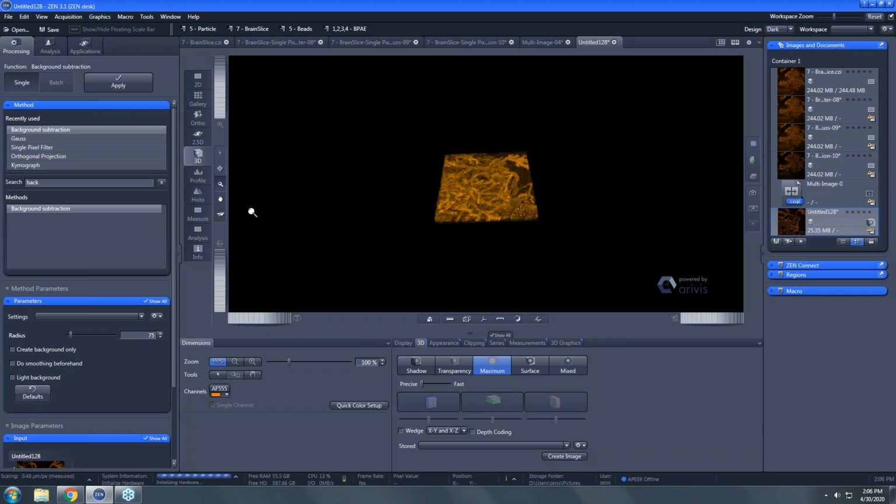You want to zoom in on that? I'm struggling to zoom in right now. Do you want to take the mouse and give it a go?